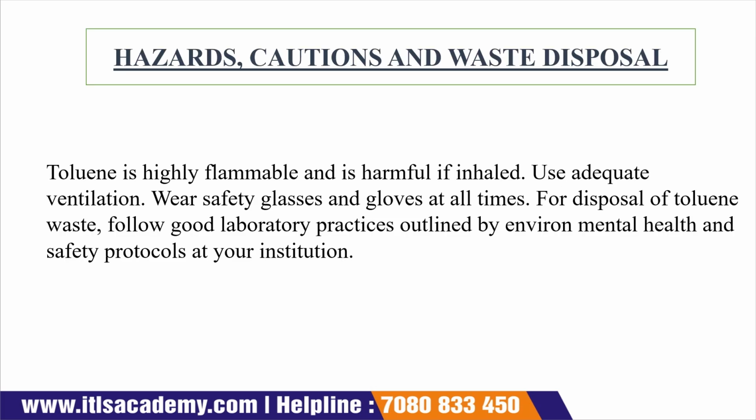Now the next one is your hazard, caution and waste disposal. We all know that toluene is highly flammable, so if we inhale it, then it will create a problem. That's why we have to use a ventilated area for this method.